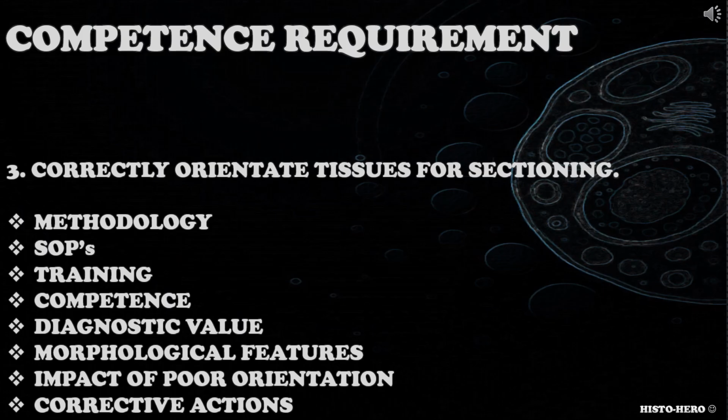When addressing this competence requirement, candidate could consider method used, SOPs, their training and competence, the diagnostic value of correctly orientated tissue, morphological tissue features demonstrated by correct tissue orientation, impact of poor orientation, ways to correct poor orientation and so on.